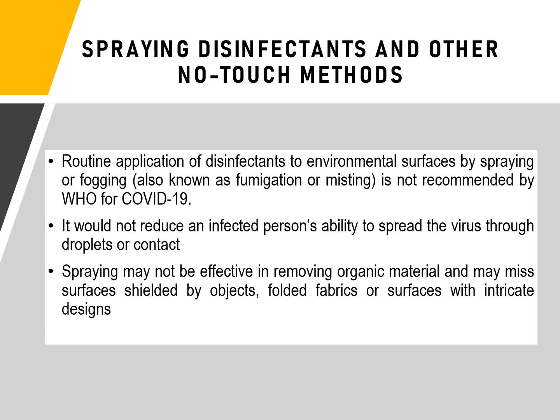The disinfection using a disinfectant in the form of a spray and wiping the surface with a disinfectant still remains the best practice for removing or decontaminating a contaminated surface.